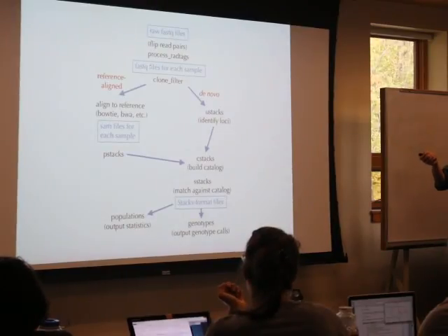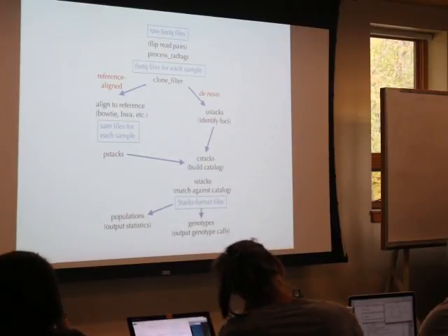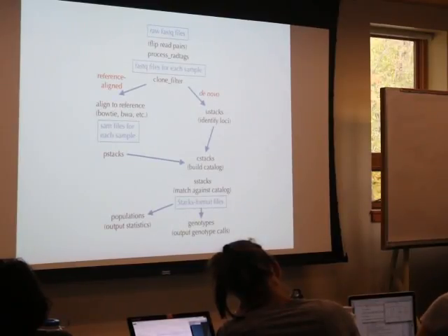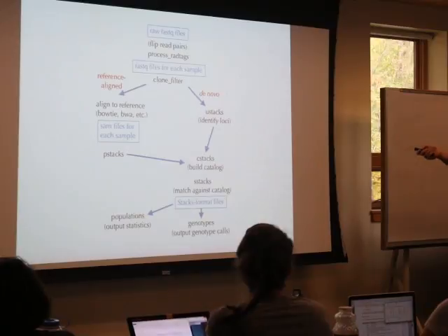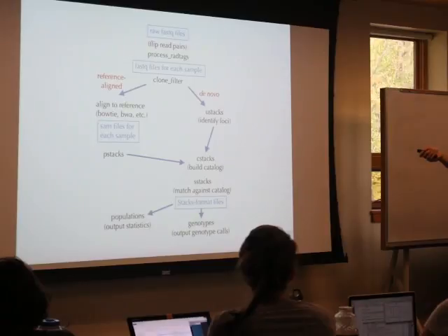Okay, so I'll show you some of these outputs. Here's the PCR duplicate step. Can you get rid of the duplicates in that case, and it wouldn't harm it? Does it necessarily matter what order? It doesn't matter. I haven't actually tested it. I expect it would take longer if you did this first, because back here you have all individuals together. And I don't think it does an all by all comparison, but it does some version of that. So once you have it split up by individual, you do that.